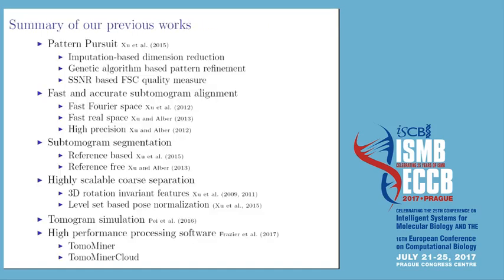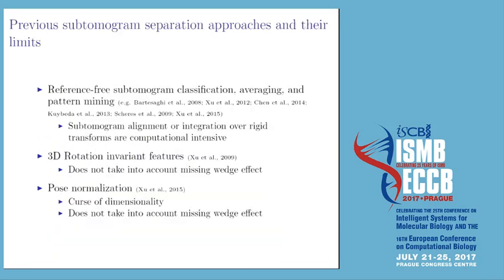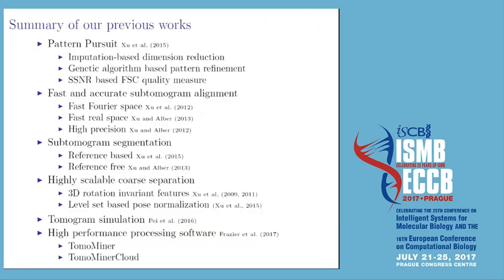Over the past years, we have developed a number of techniques to analyze such subtomograms, including structural pattern pursuit, which is a constraint optimization approach for structural pattern mining, and also different types of subtomogram alignment, segmentation and coarse separation techniques. In addition, we also developed tomogram simulation and an open source software platform, including cloud computing support.